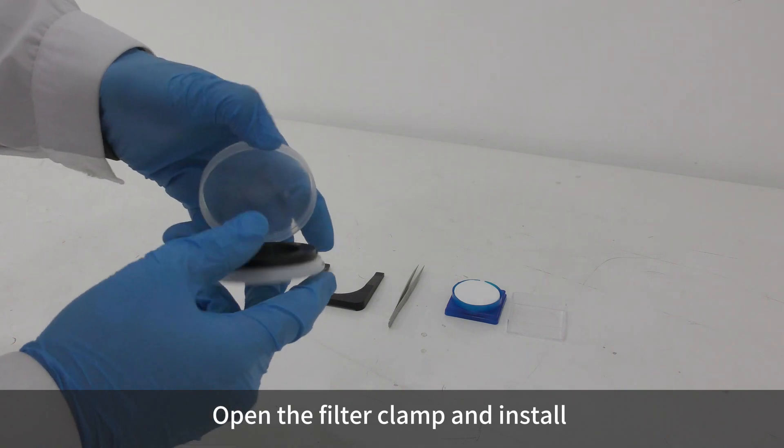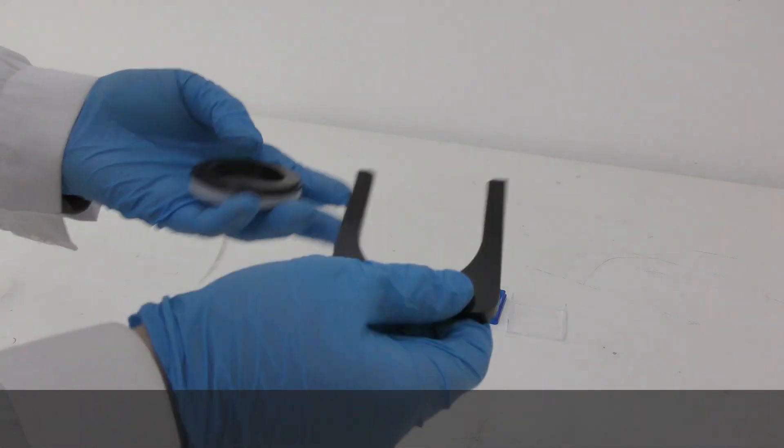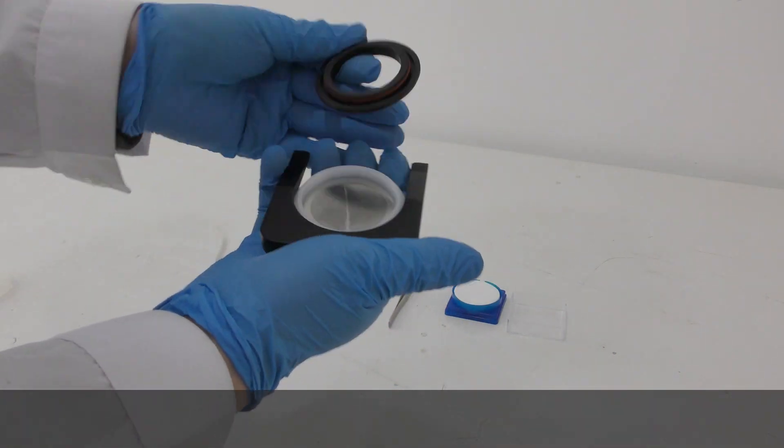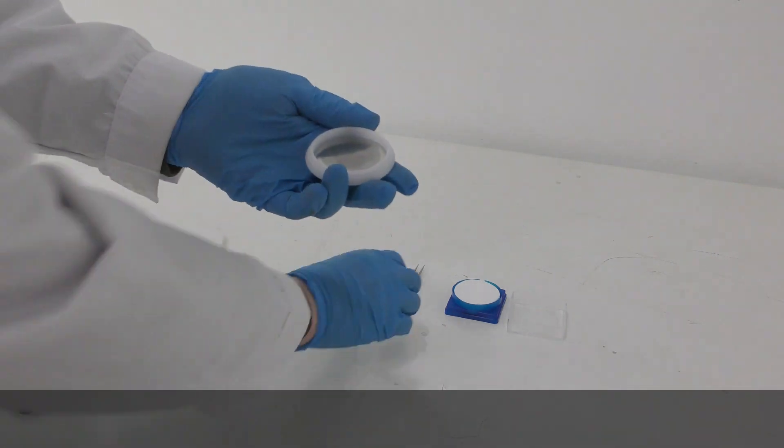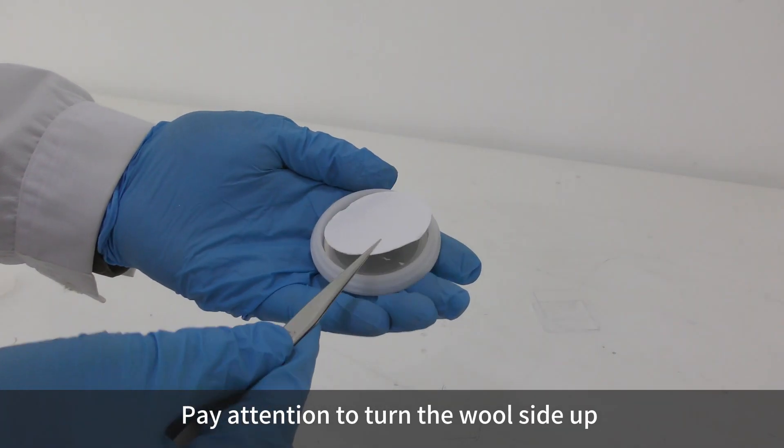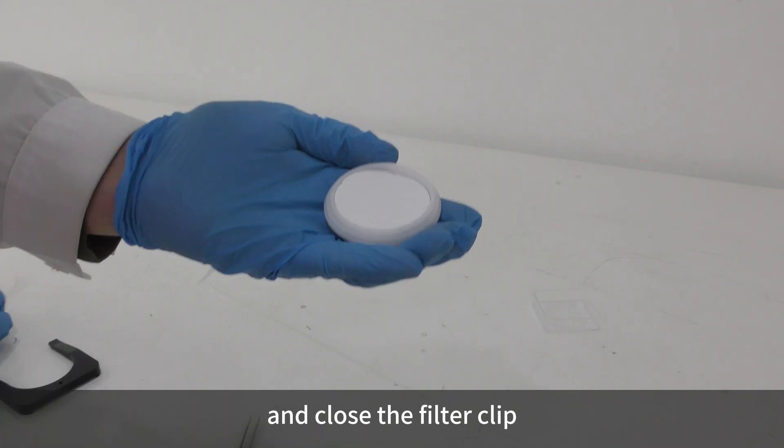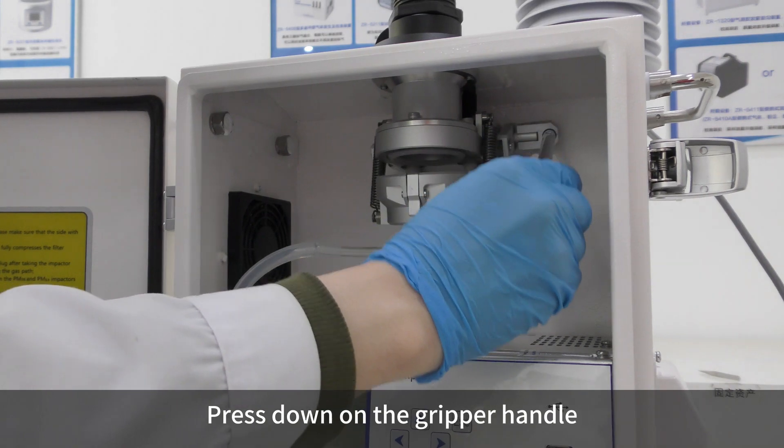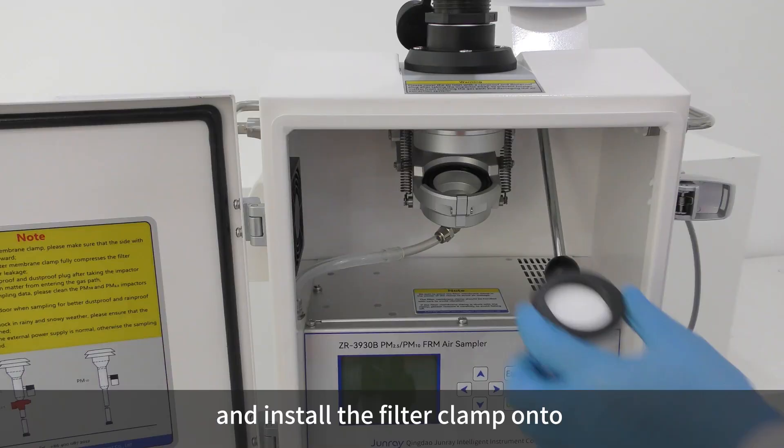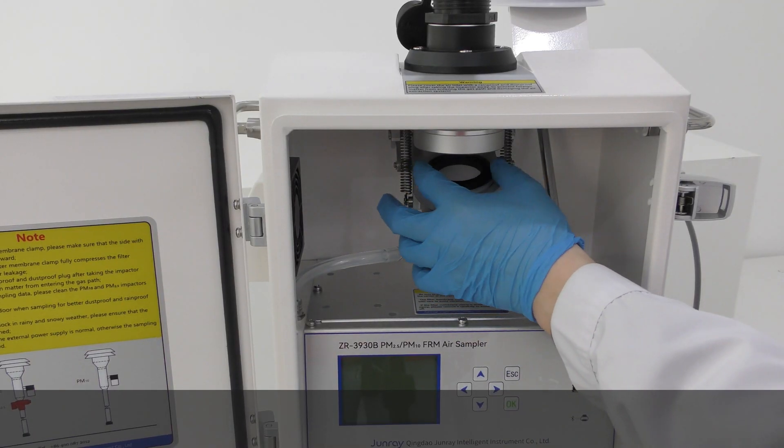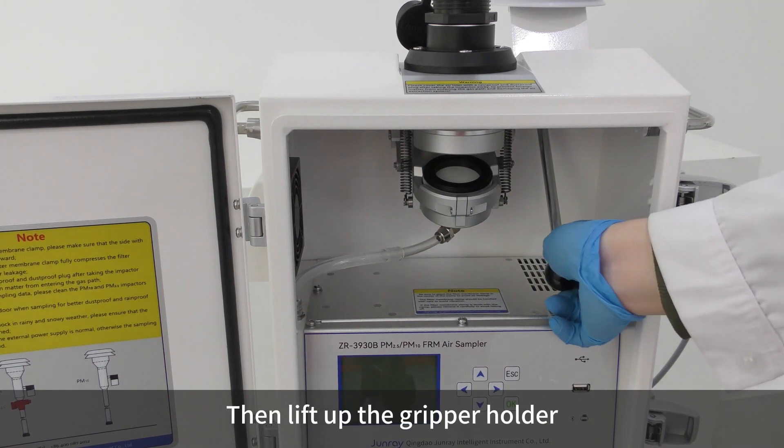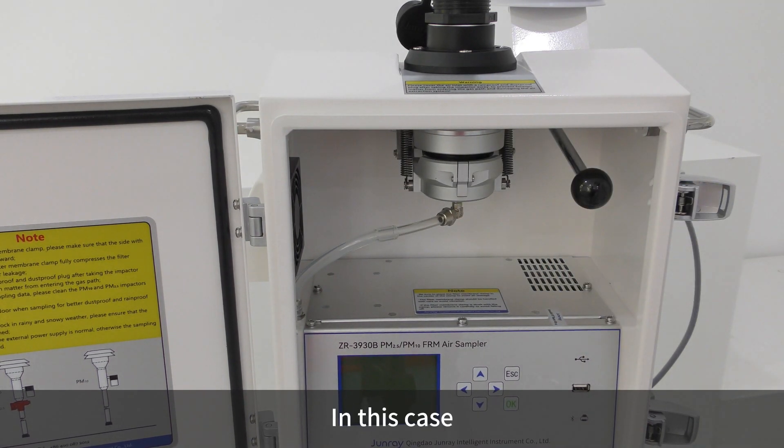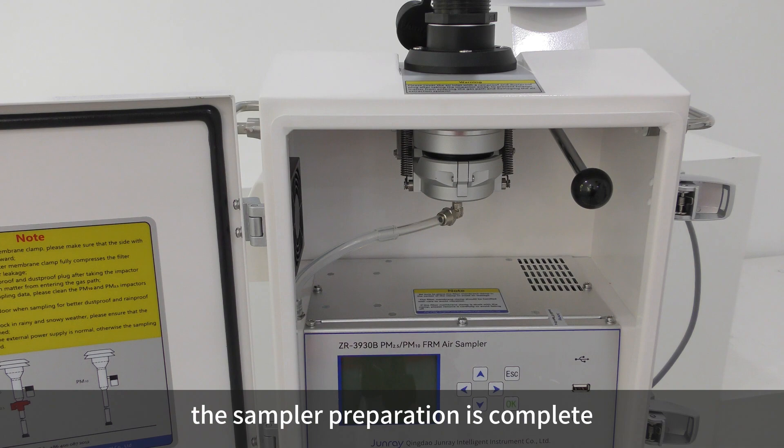Open the filter clamp and install the filter onto the mesh holder. Pay attention to turn the wool side up and close the filter clip. Press down on the gripper handle and install the filter clamp onto the filter membrane holder. Then lift up the gripper holder. The sampler preparation is complete.